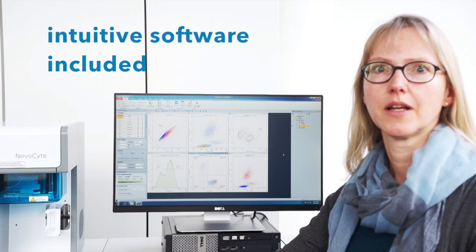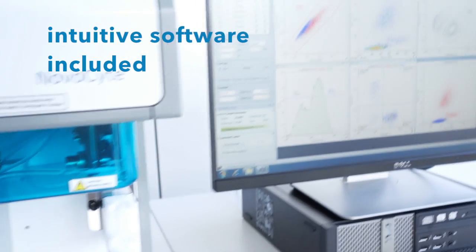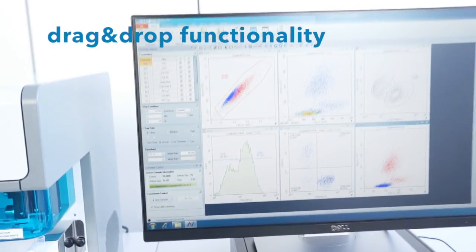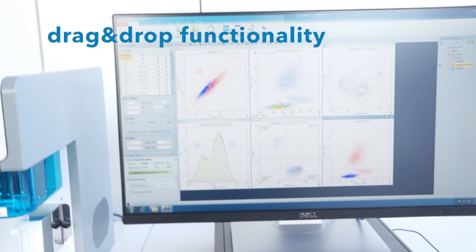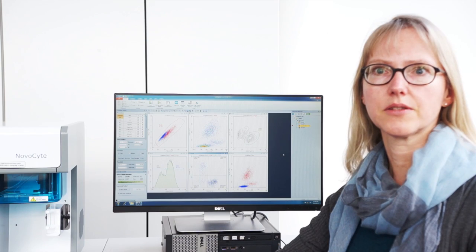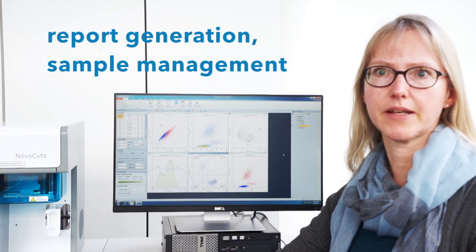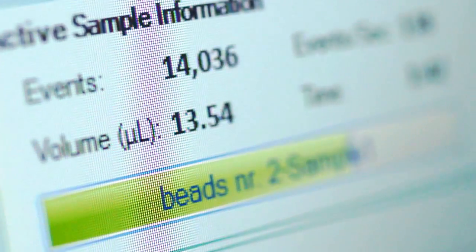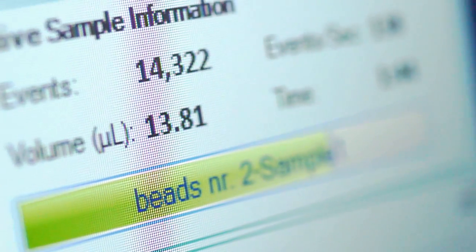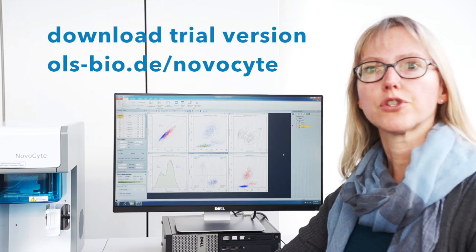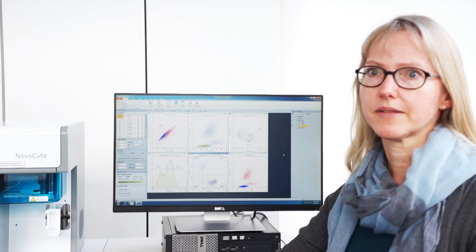The NovoCyte comes with a dedicated, powerful and intuitive software. This plug-and-play software offers a lot of automated routines and easy drag-and-drop functionalities for data analysis, report generation and sample management, making everything a breeze. If you want to convince yourself, just download the free trial version from the OLS or SCR website.